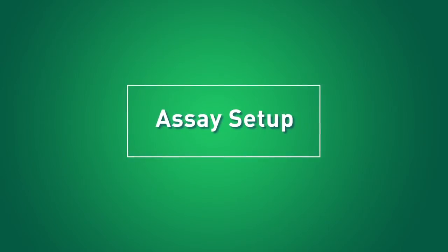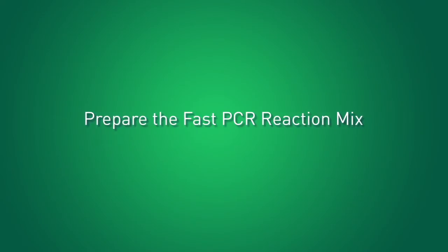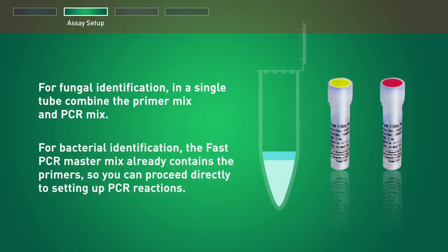The next step is setting up the real-time PCR assay. First, prepare the reaction mixture. For fungal identification, in a single tube, combine the primer mix and PCR mix. For bacterial identification, the fast PCR master mix already contains the primers, so you can proceed directly to setting up PCR reactions.